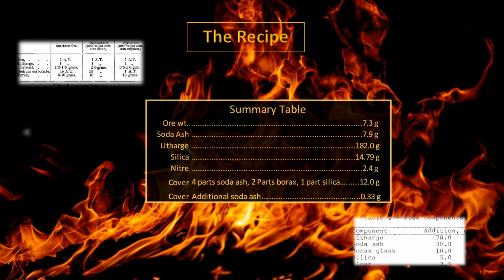Your ore samples or concentrates will vary in constituent due to the nugget effect and the homogeneity of the ore. However, if the ore sample or concentrates are from the same source material, the same summary table may be used satisfactorily for all the samples as a basic charge. Keep in mind that the sample material does and will change in properties if the sample is from a different source. There may be times that a little experimentation may be required and the charge table tweaked.